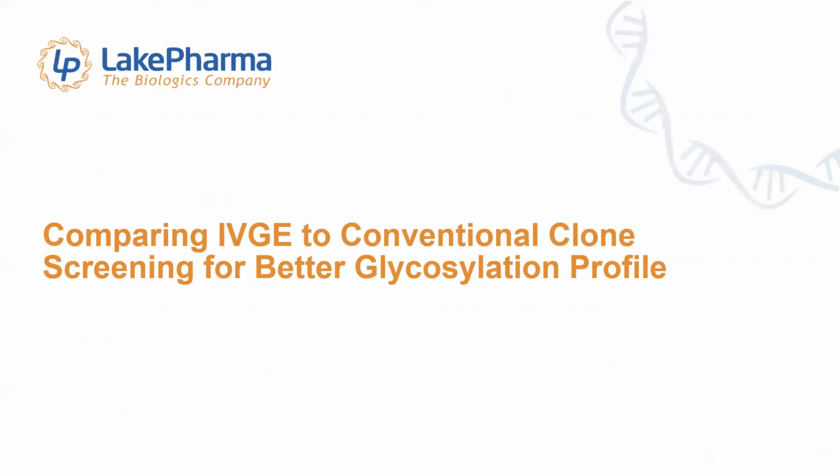So we went through an exercise looking at several stable cell line development projects of either IgG1 or IgG2, and compare an IVGE approach to a conventional clone screening approach to look at results on product quality, time and effort, as well as cost in achieving that.